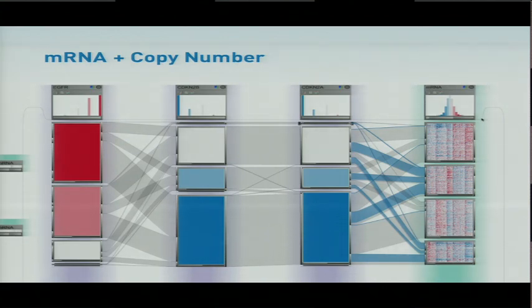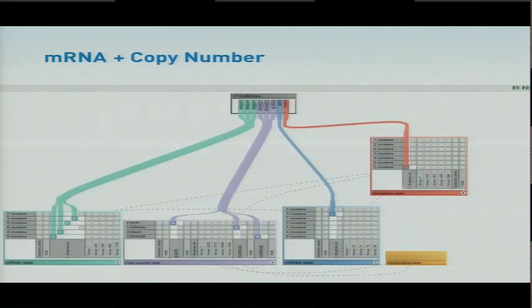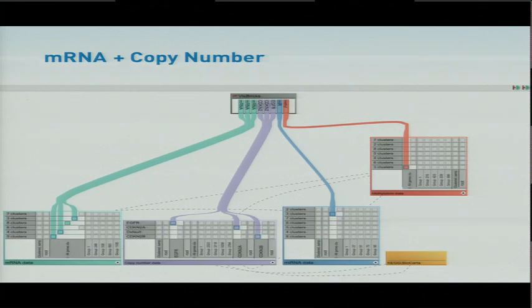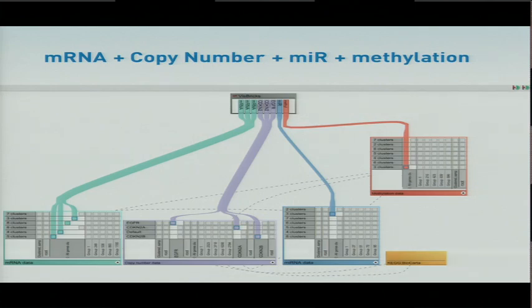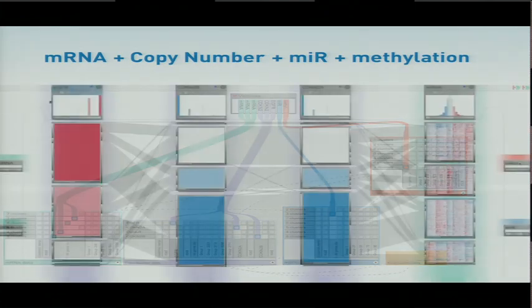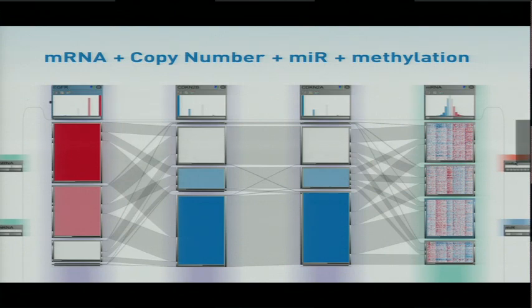Now we can see the relationship between CDKN2A and the mRNA data. All very nice. Let's throw in some more data. Let's add some microRNA data and some methylation data. So red is methylation, blue is microRNA.